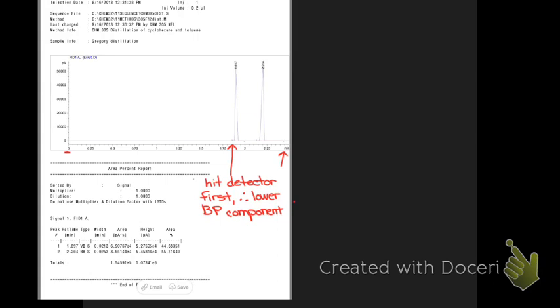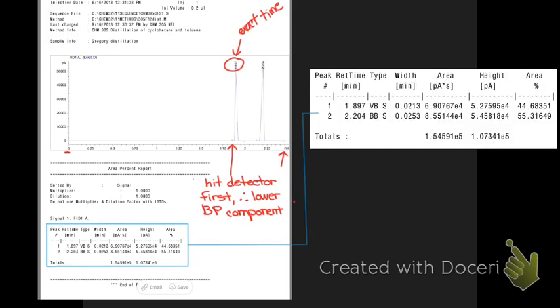So the other thing that I did want to point out to you is it does give you an exact time for when that really peaked out, your detector response. The maximum detector response is listed up at the top of the peak for you. And that will also correspond to the retention time that is down in the data chart beneath. So if I zoom in on that data chart, what you see here is basically a plot of the data for each one of those peaks.